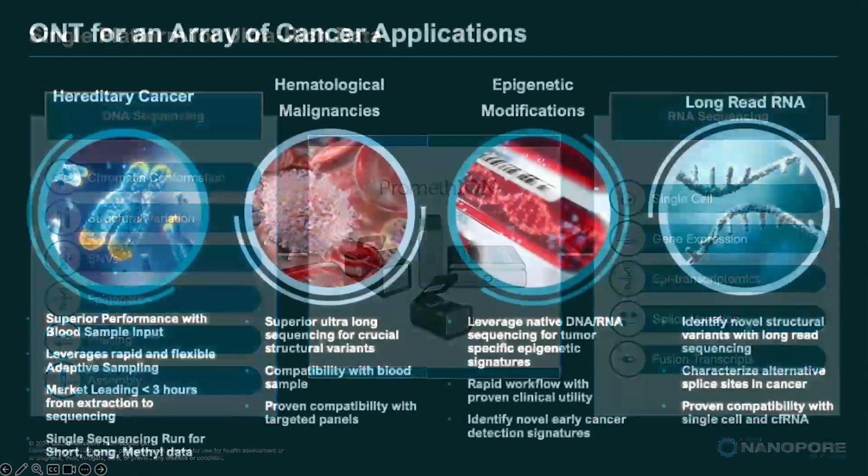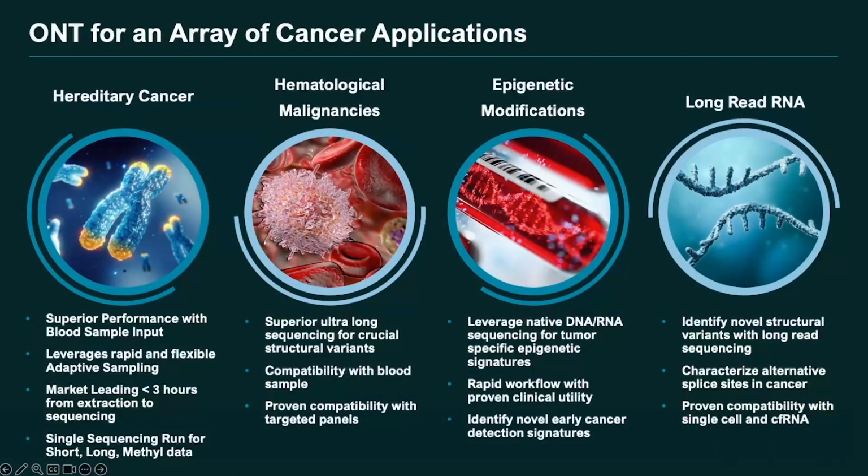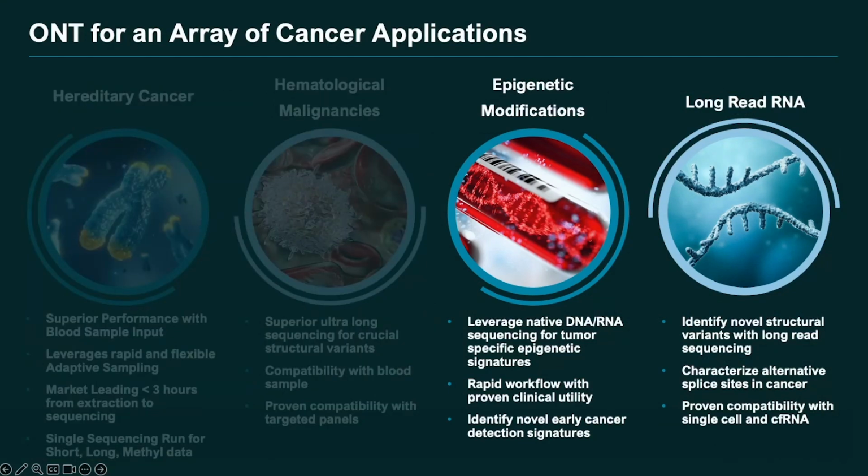And so while ONT can really be leveraged for an array of applications like hereditary cancer and hematological malignancies, Dr. Kim's talk will focus on leveraging ONT for probing epigenetic modifications and using long-read RNA sequencing to characterize the transcriptome in cancer.